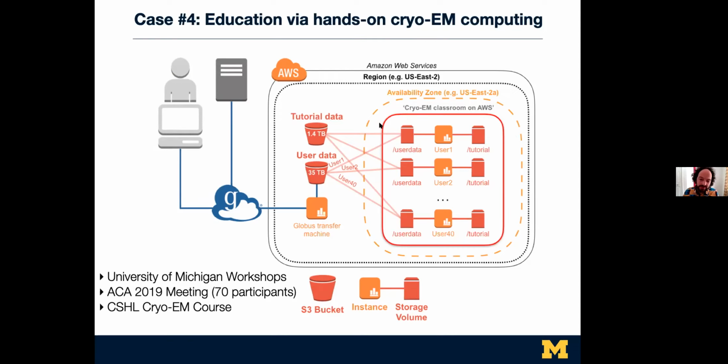And then for the week, while these participants were with us at University of Michigan, we had a workshop where we brought in developers from CryoSPARC, SIMPLE, we had RELION, you name it, Rosetta, Phoenix, and people would come in and could process their data, and then they could bring it all back. And so it was really nice, and it showed that running through tutorial data sets is really nice because it lets you see how it should go.